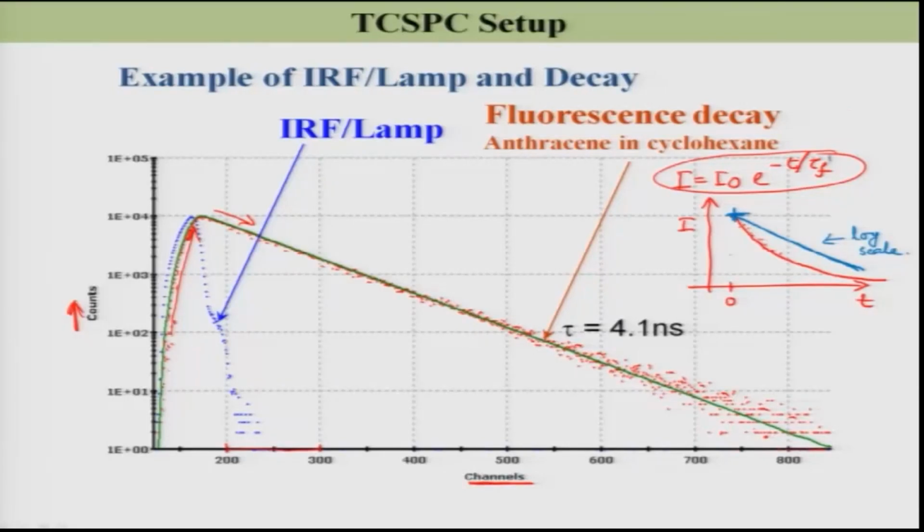And to analyze this, you see these red dots, it is like this shape. To analyze this, the analyzed curve is this green curve, as you can see here. See this green curve, this is my analyzed curve. To get the value, this is the fitting line. Then I will understand what the value of tau A is from here.